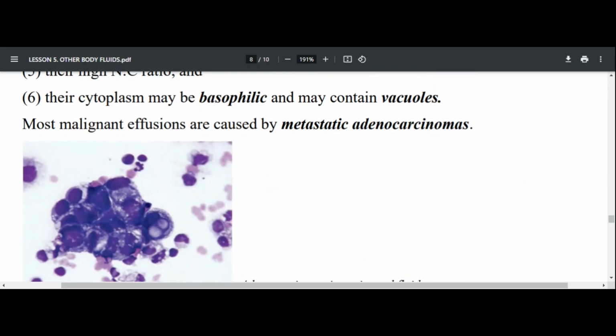So in that case, you would be able to see leukemic cells or leukemic blast cells, as well as lymphoma mature cells, like mature lymphatic neoplasms. Sometimes you'd see mature lymphocytic cells also appearing in these fluids, depending on the degree of metastasis.